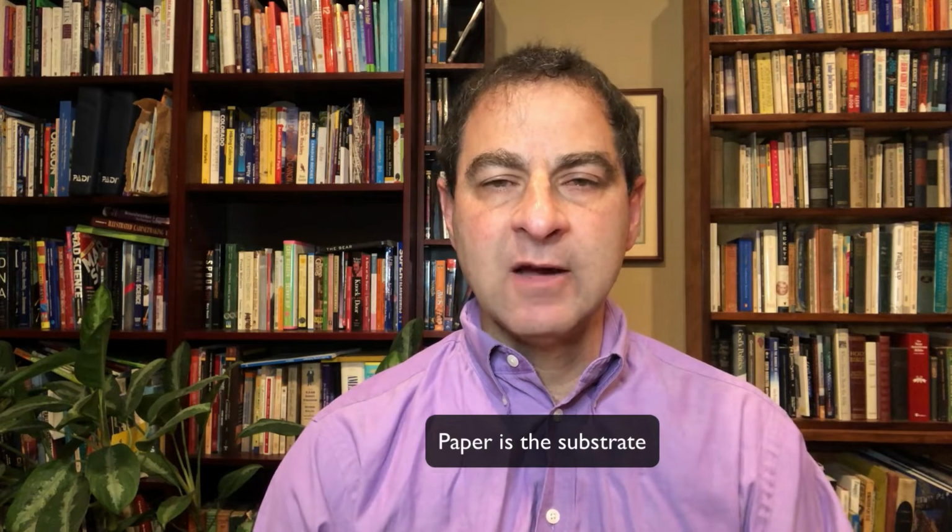We're going to have a substance. This is the thing we're trying to figure out about. It's going to be placed on, in this case, a piece of paper, a substrate. There's other substrates we can use. You can do gas chromatography, you can do thin layer chromatography. We're doing paper chromatography. We're going to place that spot onto a piece of paper. We're going to put that paper so that the bottom of it is exposed to an eluting solvent. The eluting solvent is going to travel up the paper.